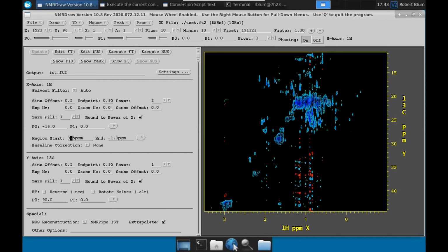And it's got a bunch of, again, these look like artifacts because there's something really large here, and there's a bunch of suspiciously vertical blips. So those are our sampling artifacts. Yeah, we've seen. And so then I guess we could do the NUS function.